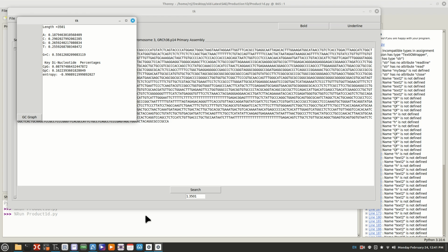I'm going to record that GPX1 GC is 55.6% GC, so a little bit more, and the CpG is 8.8%. All right. In other words, GPX1 is considerably higher GC content for the entire sequence, anyhow.